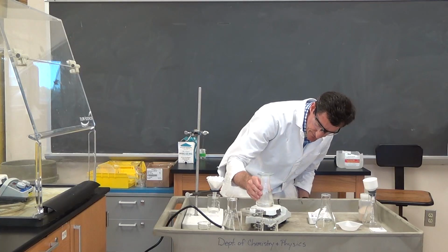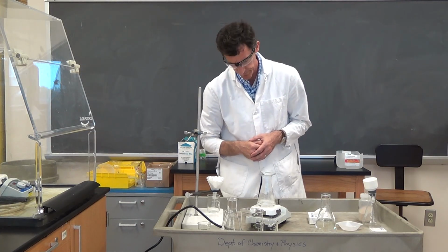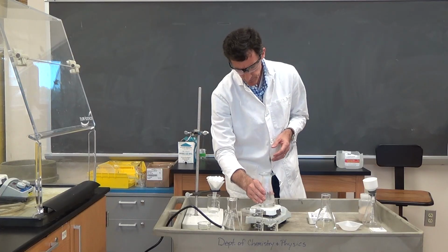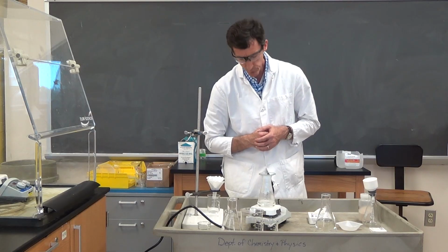This is nice and hot. How hot is it? Well, water boils at 100 degrees. If this was methanol, this would be about 65 degrees. You need to know the boiling point of the solvent you're working with.